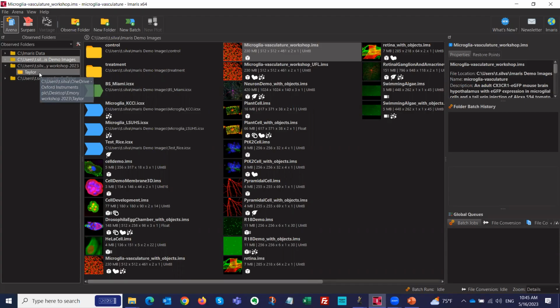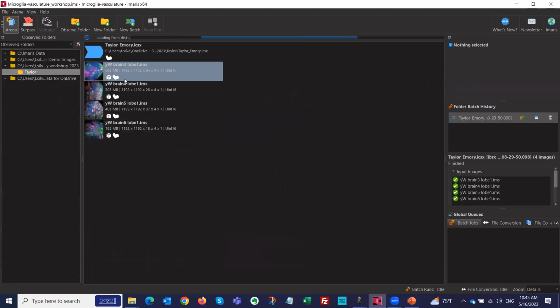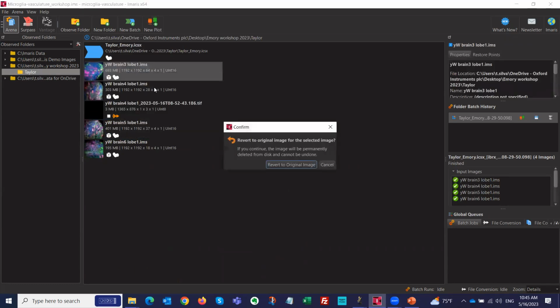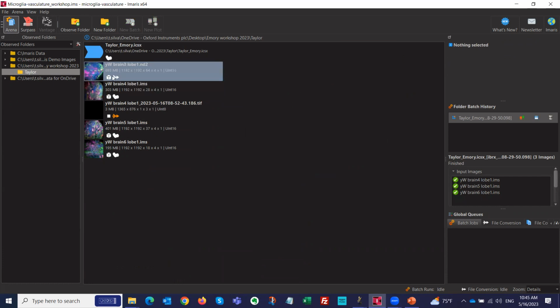Taylor, are you okay if I just throw it on your data real quick? Yeah, because I did work with Taylor before here. So this is Taylor's data. So I will revert quickly to original image. So this is what it looks like.